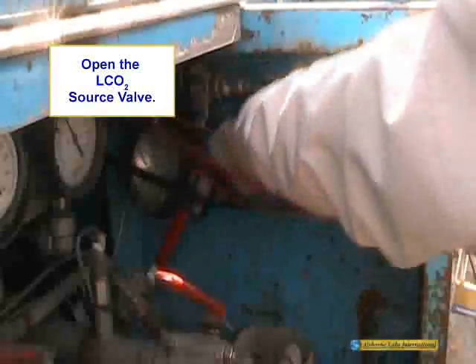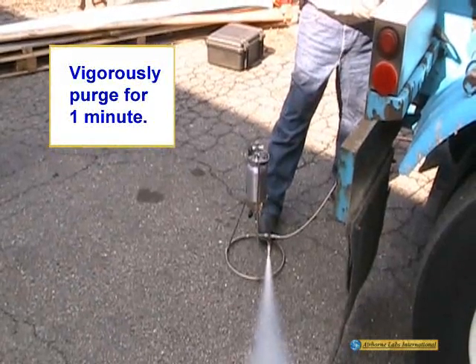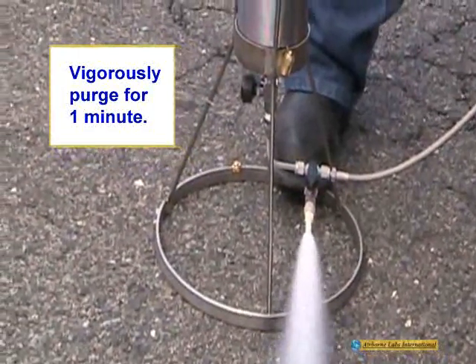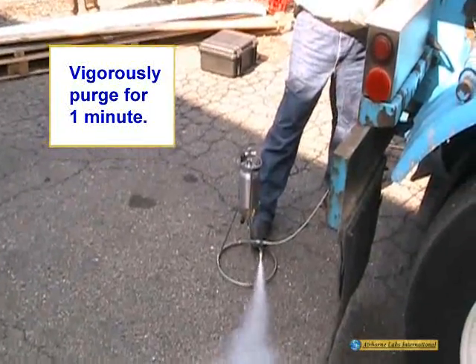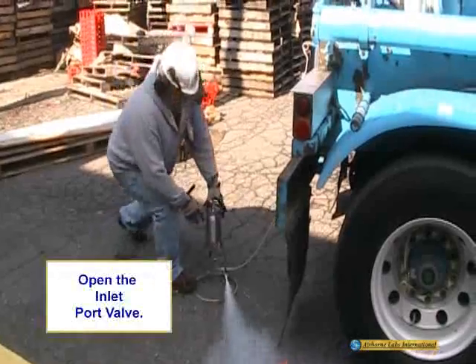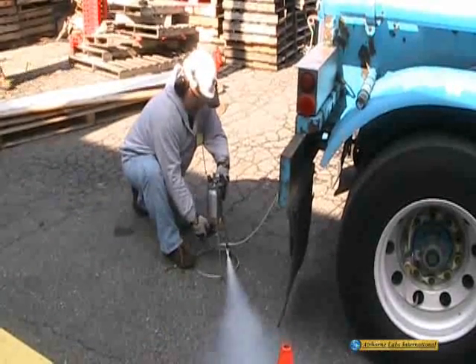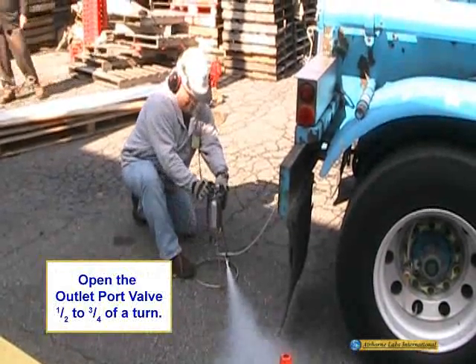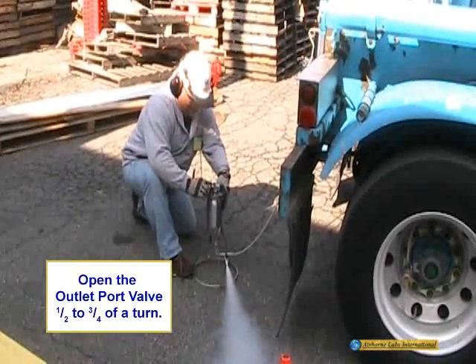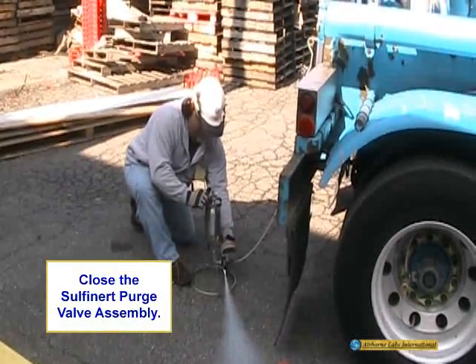Open the transfer line purge valve. Carefully open the liquid CO2 source valve and allow the transfer line to vigorously purge for about 1 minute. With the liquid CO2 source valve and purge valve open, fully open the 1-liter cylinder's inlet port valve, which will start the filling of the cylinder with liquid phase CO2. Immediately crack open the cylinder's outlet port valve about half to three-quarters turn to allow all residual CO2 gas from a previous sample or any entrained air to vent. Once cylinder filling has started, close the purge valve.